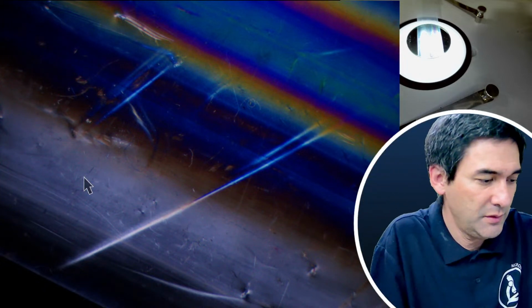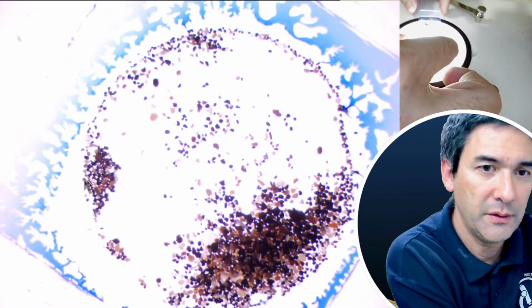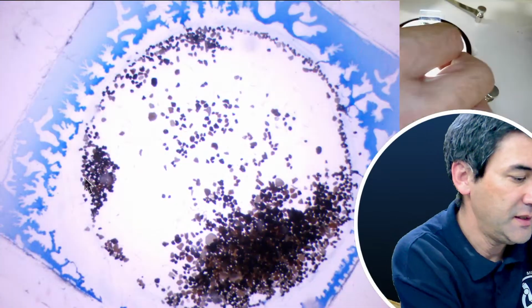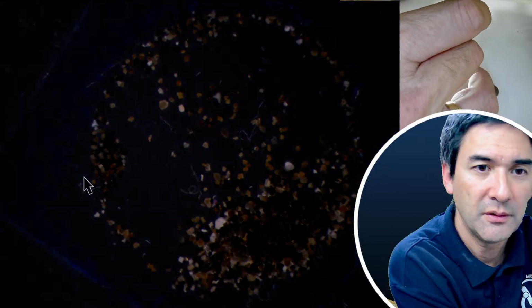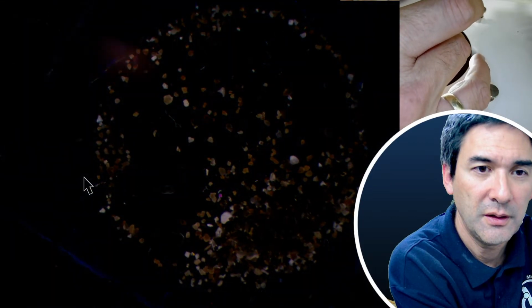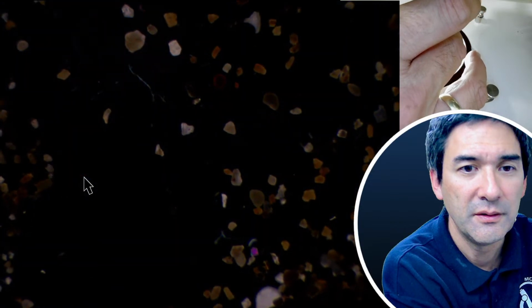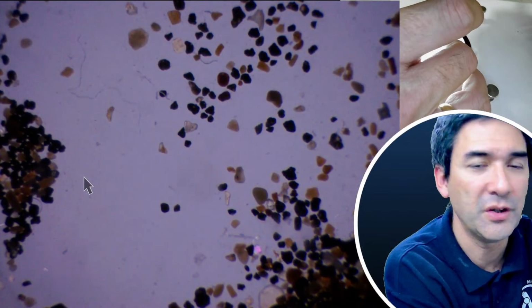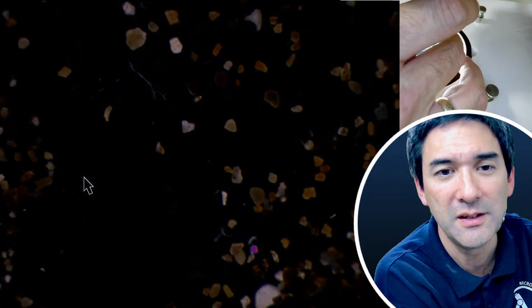Remember this here from before. Unfortunately, I didn't label it, so I don't remember which sand this is. Okay. Ah, look, that's actually quite nice. The dark sand grains, of course, don't allow any light to go through at all, so they completely disappear.